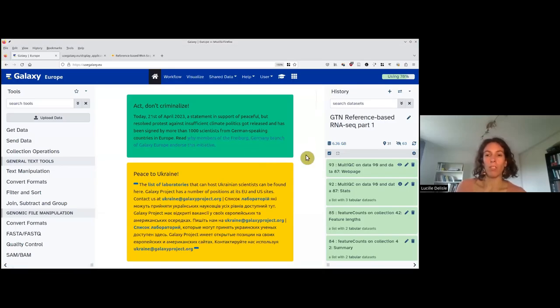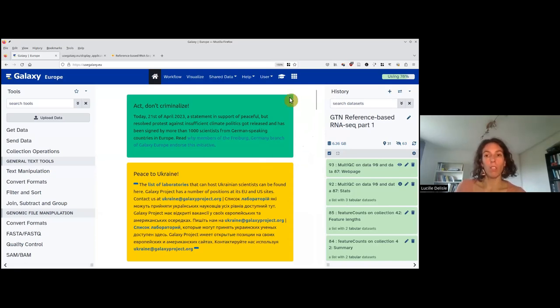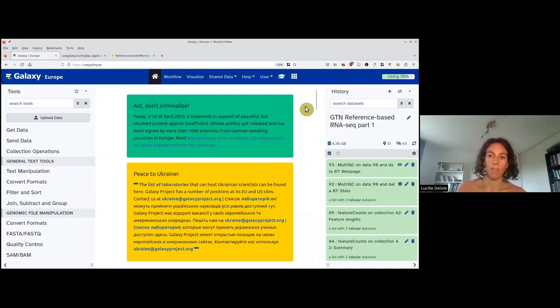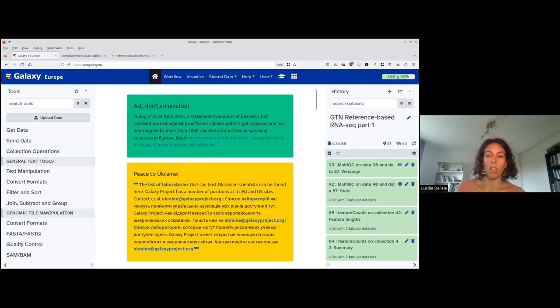So now we are together, people that chose to use STAR or people that decided to use feature counts. I'm showing here the history with the feature count, but the people with STAR will still be able to follow. In the tutorial, what is suggested is to determine which gene has the most counts. What we have, whether using STAR or feature counts, is a file with the first column as the ID and the second column as the count. To find which one has the highest number of reads, we can use a tool called sort.